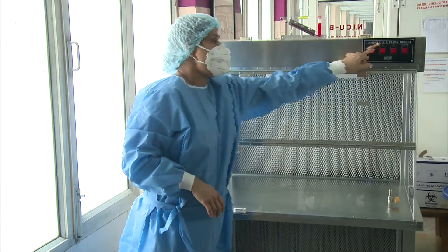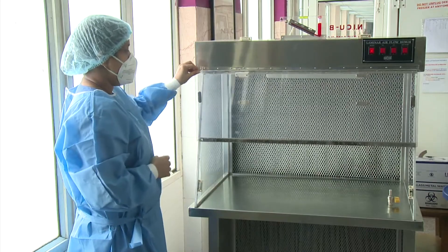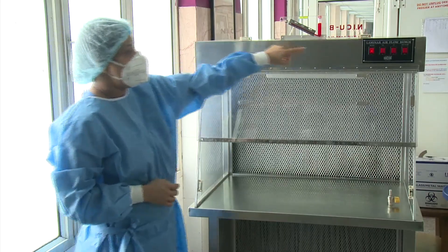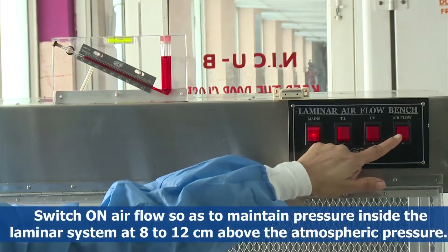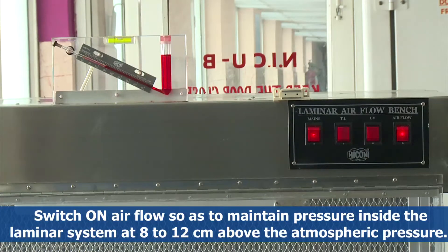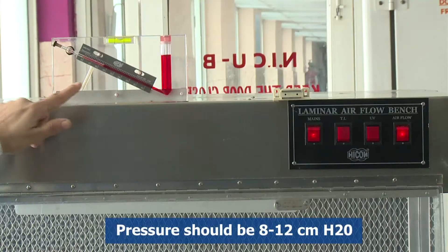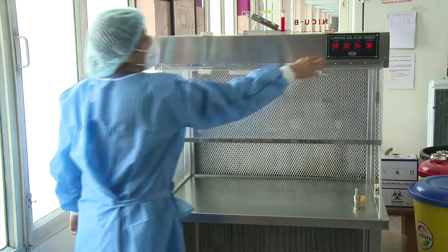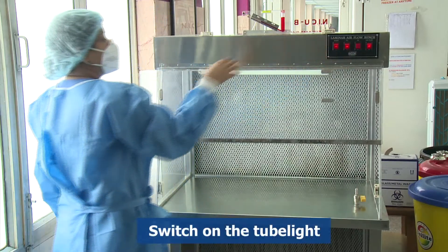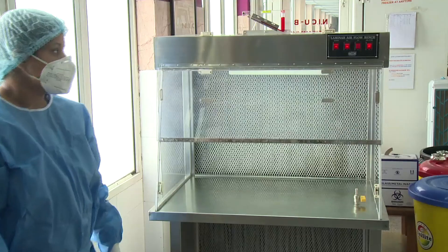Switch off the blue UV light and open the front panel. Switch on airflow so as to maintain pressure inside the laminar system at 8 to 12 centimeters above the atmospheric pressure. Notice this by the movement of the red water column on top of the instrument. Switch on the tube light — laminar flow is now ready for use.